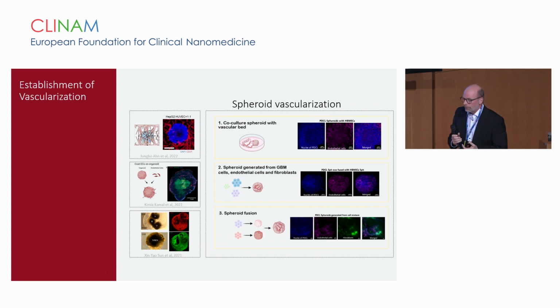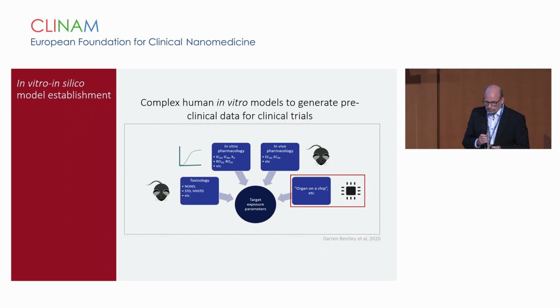Or you go for spheroid fusion. That's another approach which was described in the literature. We are now in the process of exploring which one works best for us. So you see, or maybe hardly see, there are similar outcomes as described in the literature, but you all probably agree with me that there is still room for improvement, and that's exactly what we're striving for.